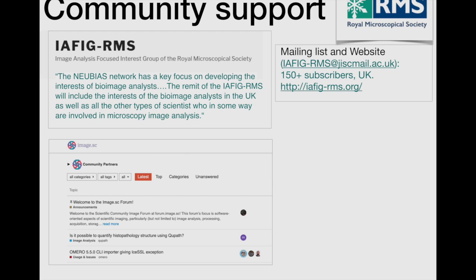But this isn't really a list for asking questions about image analysis. What I would really recommend for that is the image.sc forum, because a lot of the people doing image analysis in this community, and also NEUBIAS, which is like the EU-wide umbrella for image analysis, a lot of their members are here, and this is really the place to be asking questions about how to do things. And it's been taken on by many of the big software people for bioimage analysis. So really, this is where everyone converges, and it's a really nice forum. People are very responsive, and a lot of people are using it. So this is really good.